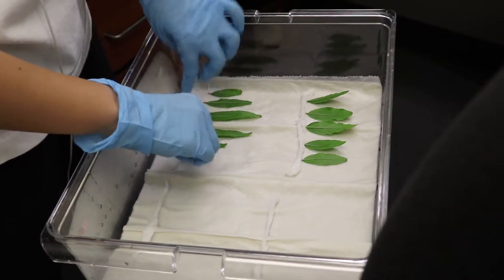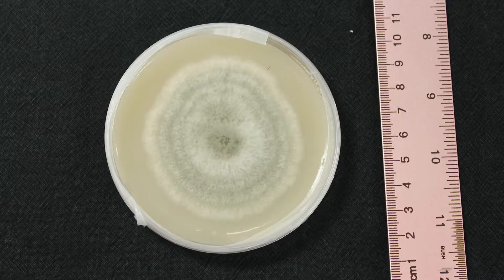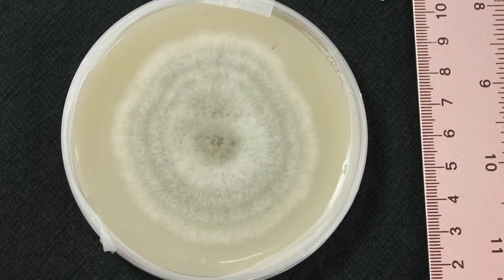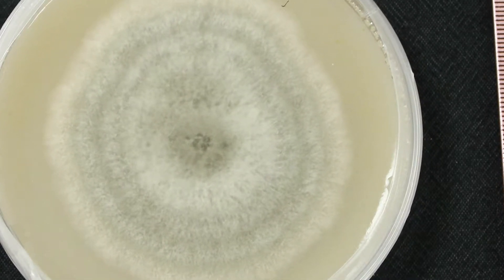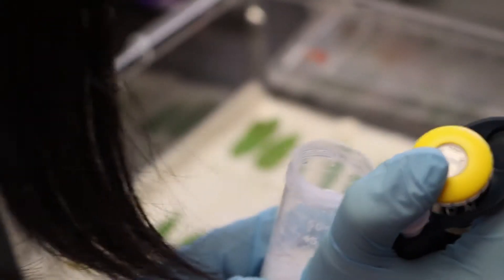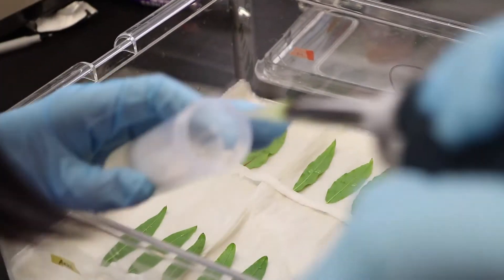Then we prepare the inoculum suspension. I typically use seven to ten day old cultures of Colletotrichum, wash the spores, and dilute them to adjust the concentration to 1×10⁵ spores per milliliter.